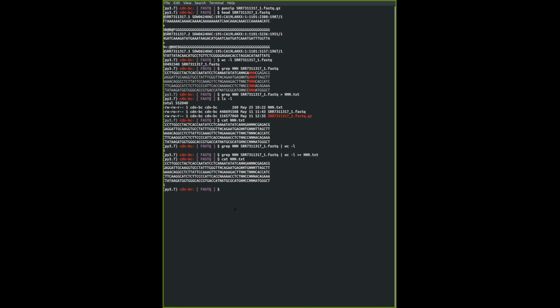Right, and last but not least, if you have not done so, we can compress this file again by typing gzip followed by the name of the FastQ file. This will take quite a while to perform. And I think that's about it that we covered last week. So I'm going to copy this whole set of code into Etherpad, and we can continue on.